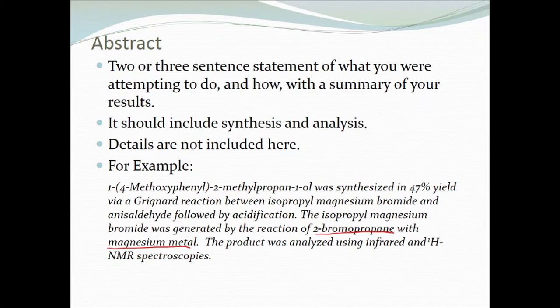But we do not recap the procedure. We don't mention the reflux or the distillation or the fact that we washed it. None of that is in the abstract. That will, of course, be in your procedure.